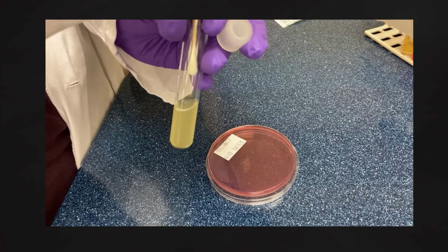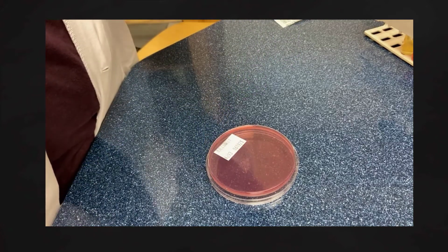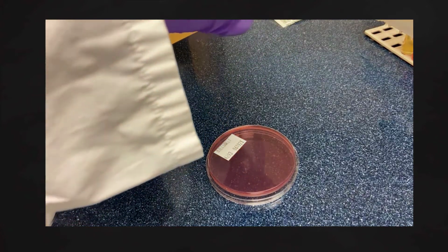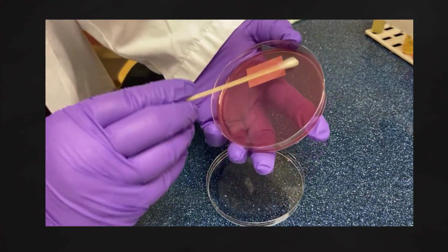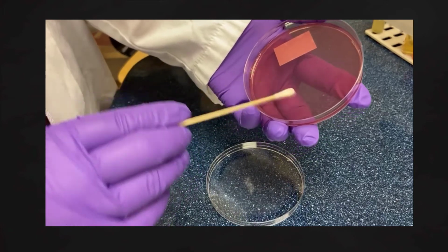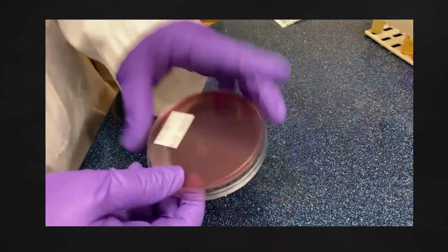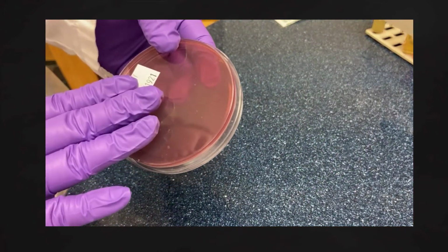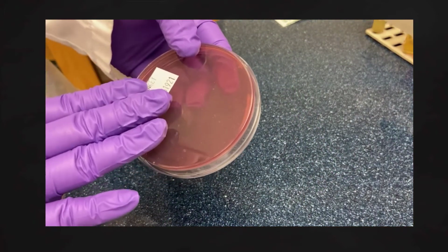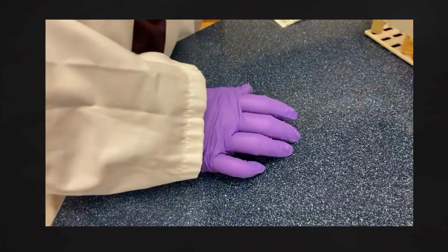Again, I'm going to go through the process of getting excess fluid off. Lid on. Okay, and in this case, I'm just going to run it back and forth in a zigzag pattern, because it's the only thing that I'm growing on this particular plate. And this, again, is one of those selective differential media. It's gram-negative, so it should grow. And then we're going to see if it can actually do lactose fermentation.